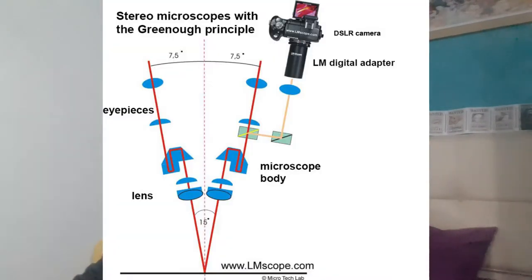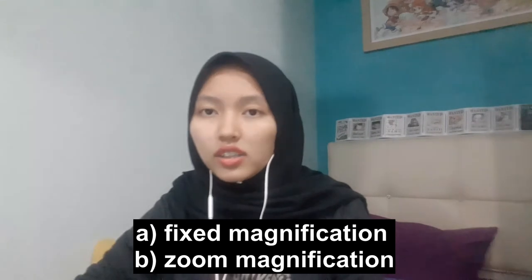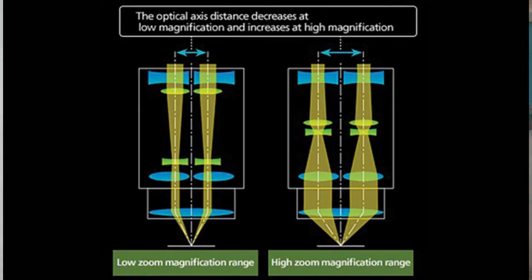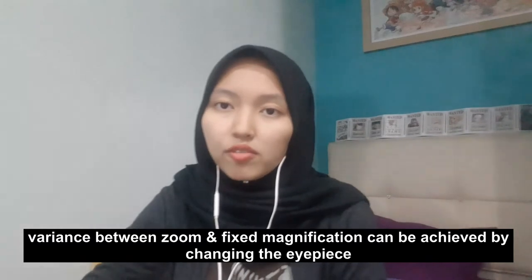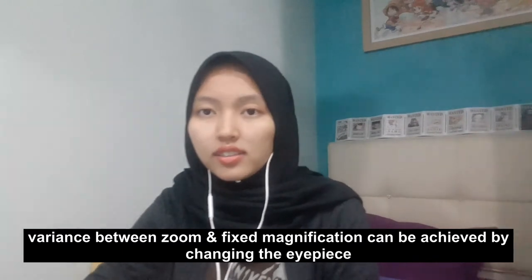Stereo microscope works with two magnification systems. The first one is fixed magnification and the second one is zoom magnification. Fixed magnification is where two objective lenses provide a degree of magnification, and the zoom magnification offers a continuous magnification at a variable range using the auxiliary objective, whose function is to increase total magnification depending on some factors. The variance between the zoom and fixed magnification can be achieved by changing the eyepiece lenses.